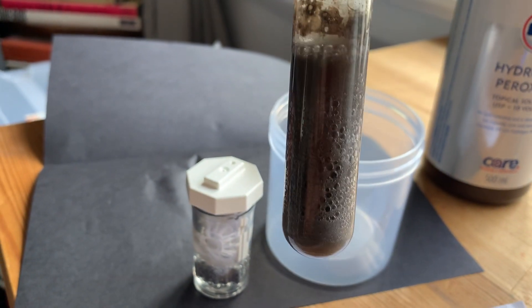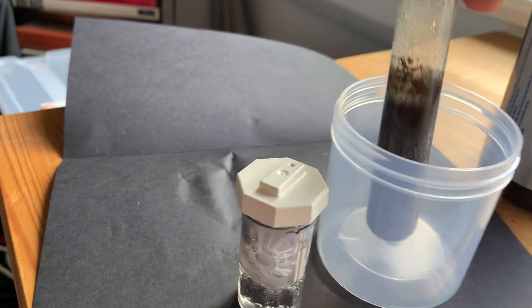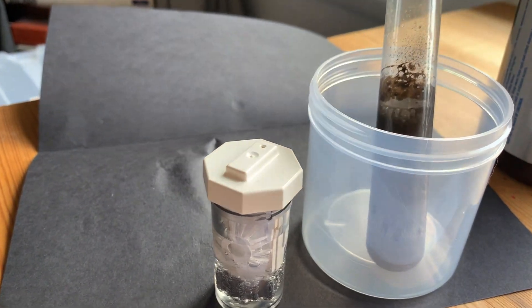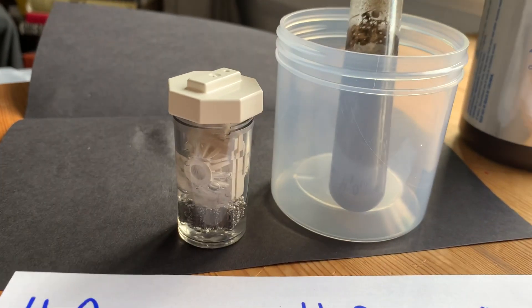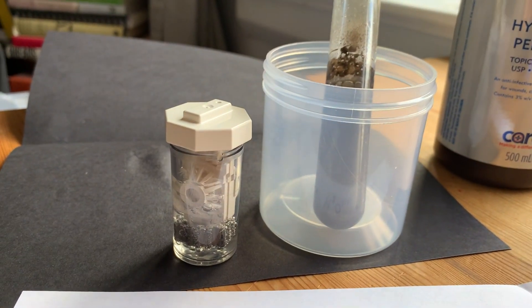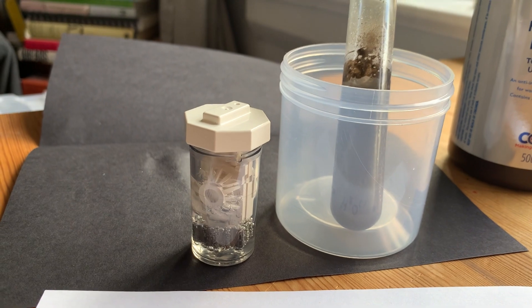This is proceeding faster, mostly because the manganese dioxide is powdered. That increases surface area. Surface area is one of the ways you can speed up or help control the rate of a reaction. Wow, it's really going there.